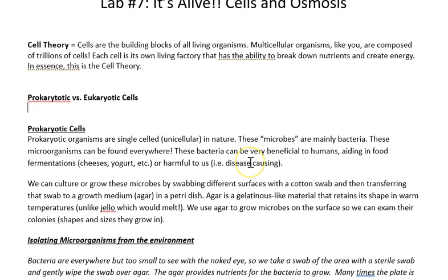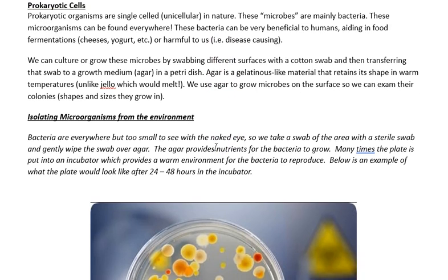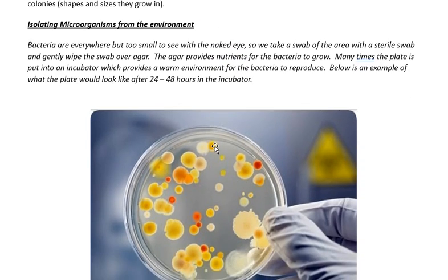We're looking here at the difference between prokaryotic and eukaryotic cells. This may be your first exposure to talking about bacteria. This discussion here just goes over how you can see the bacteria and determine which bacteria are in your environment or in your throat or wherever you're testing.